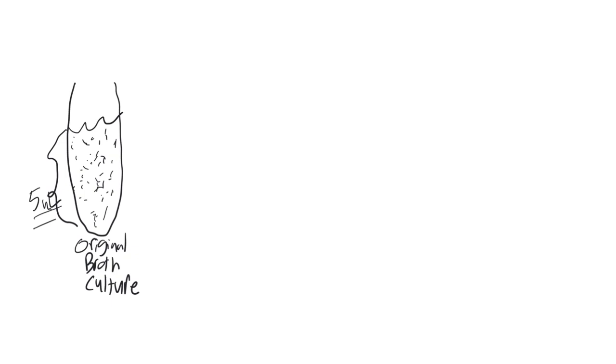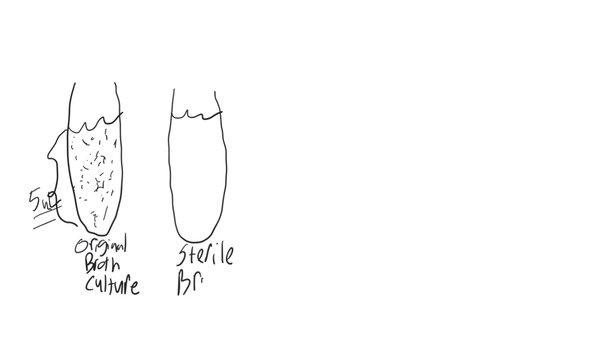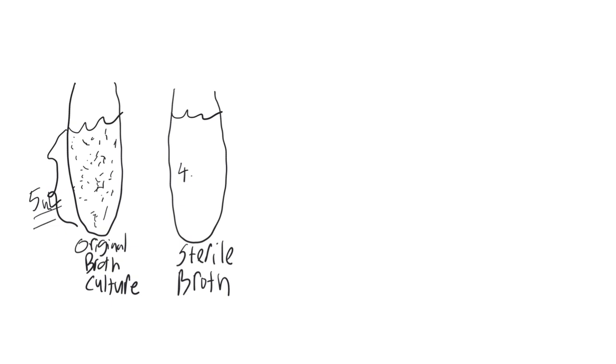To begin my dilution, let's say that I have a sterile broth here, and this sterile broth has 4.9 milliliters of sterile broth in it.